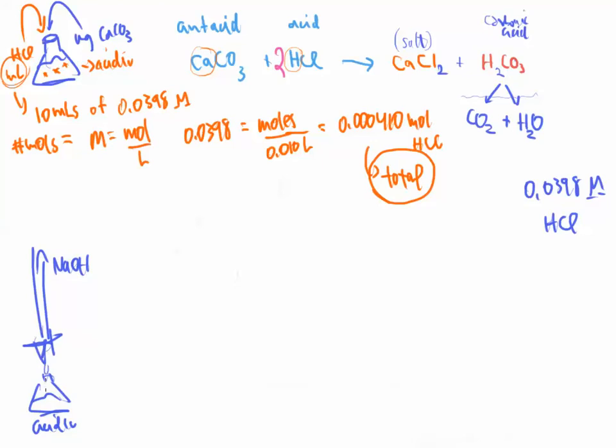Well, I titrated to a point where the color change happened, and this color change happens at a certain volume. So at the color change, I record the number of milliliters of NaOH that it took in order to titrate that sample from acidic to basic again.